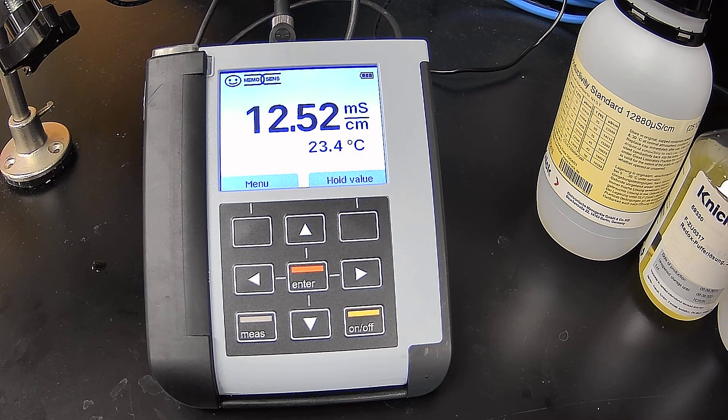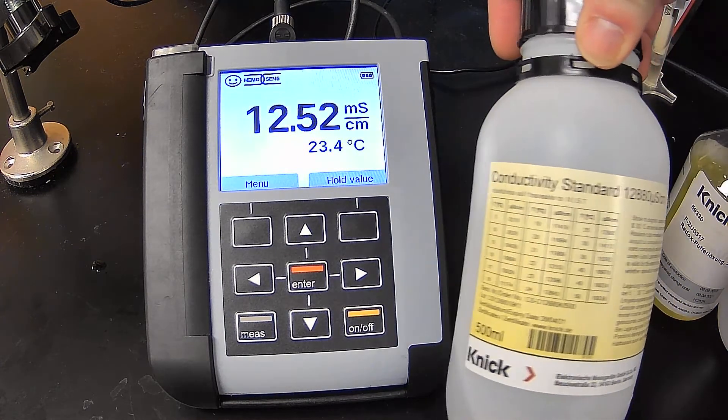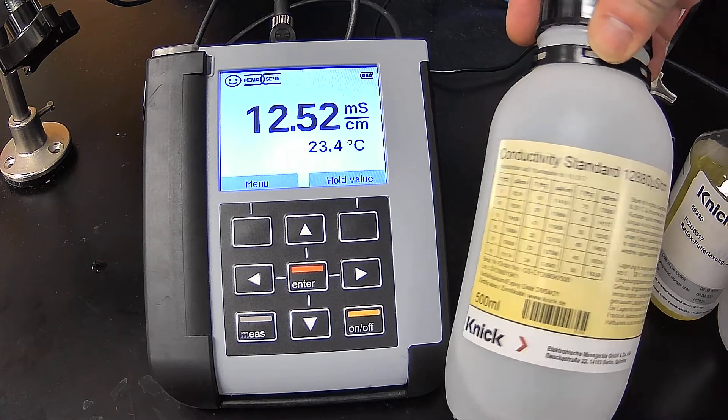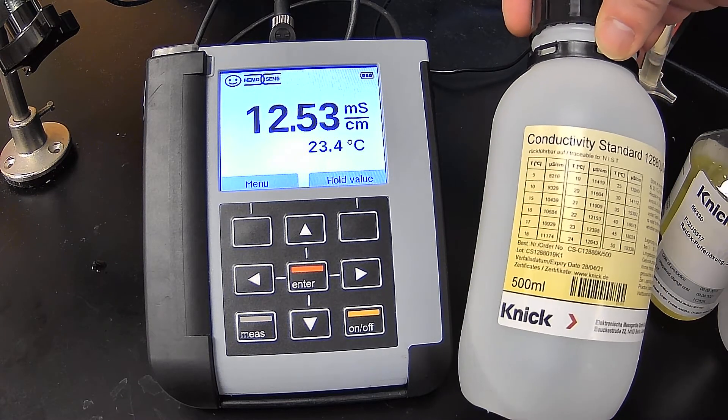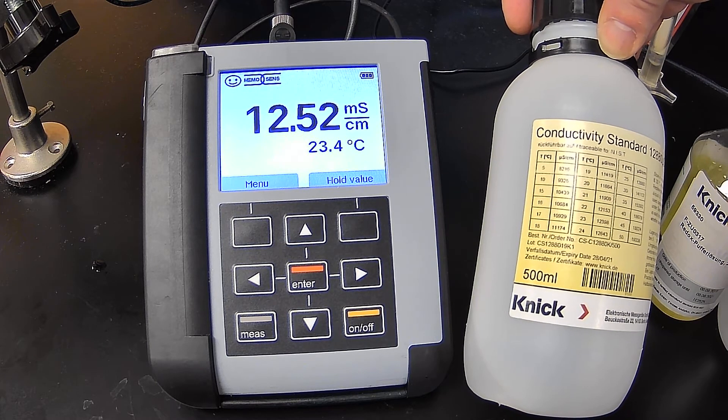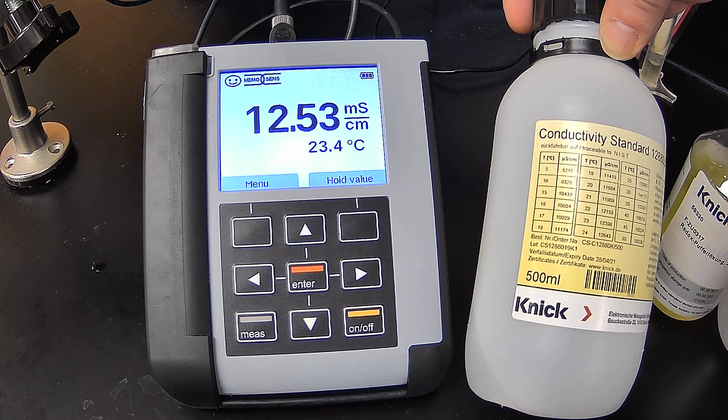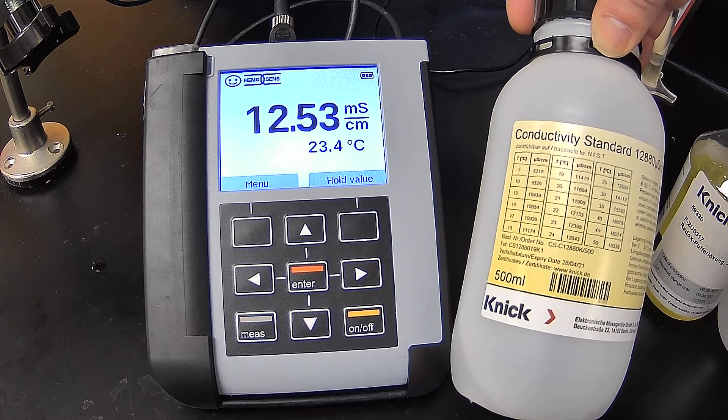So again, it's a one-point calibration. There are multiple ways to calibrate a conductivity probe, but in this case, we're going to use a 12,880 microsiemen calibration solution. And at 23 degrees Celsius, that is going to be 12,398 microsiemens.